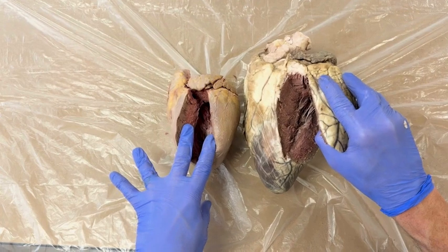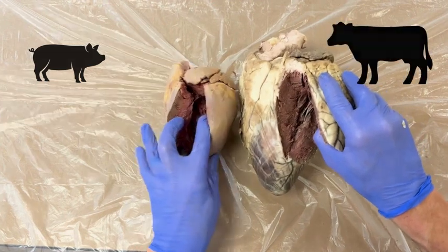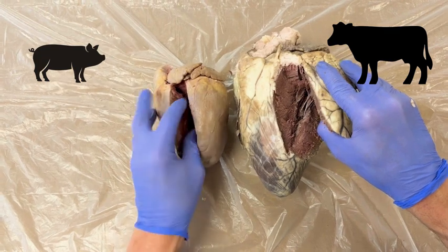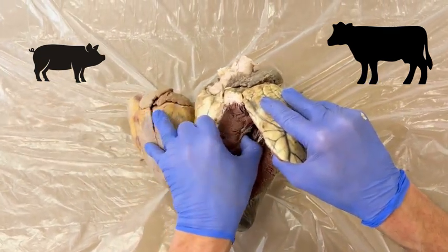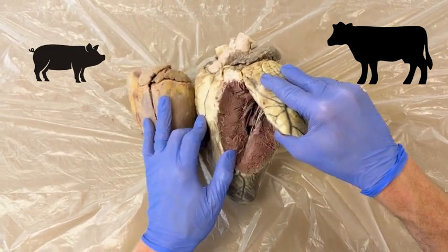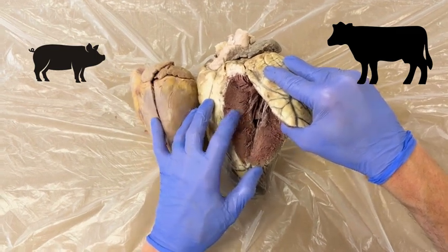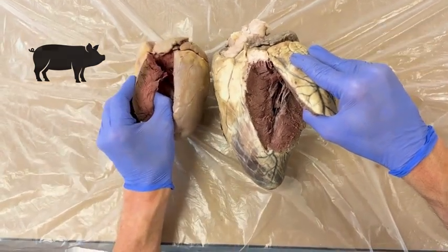So this shows the open left ventricle of the pig and the cow. And you can see the difference in wall thickness of the left ventricle. The pig heart, while thick, is nothing compared to the cow. Look how thick that is. Blood is having to be pumped to a large, massive creature, and so the left ventricle is adapted for that and is very thick-walled compared to the pig, which is a smaller mammal.